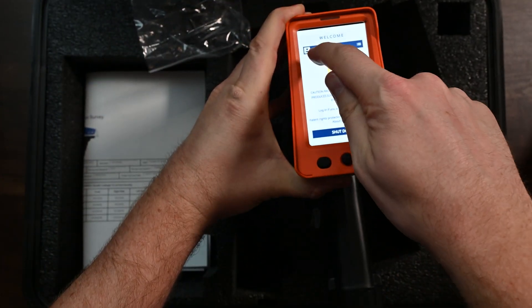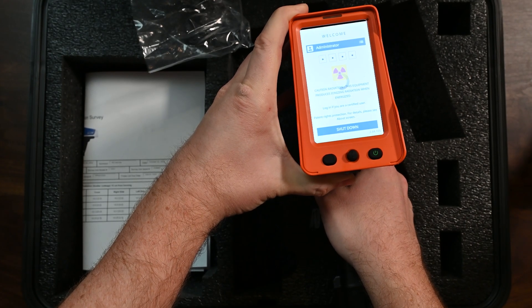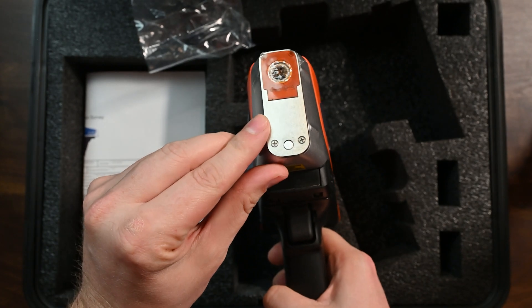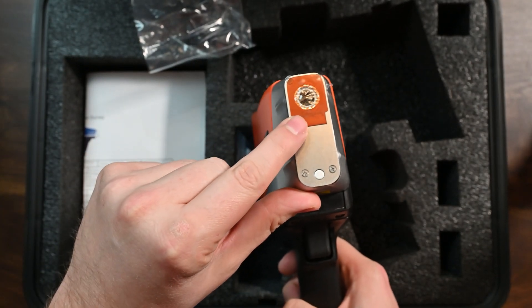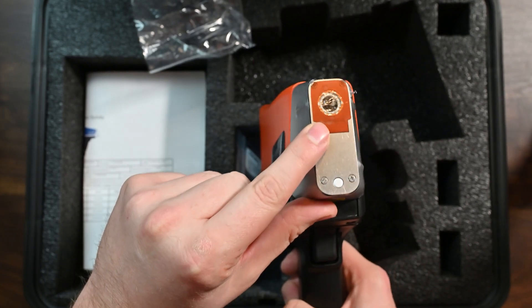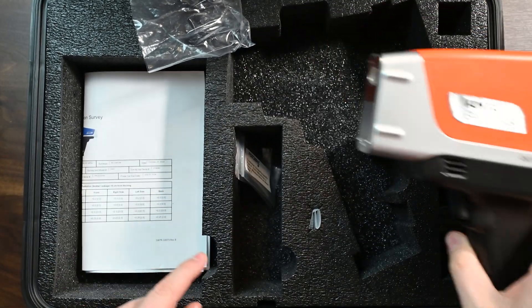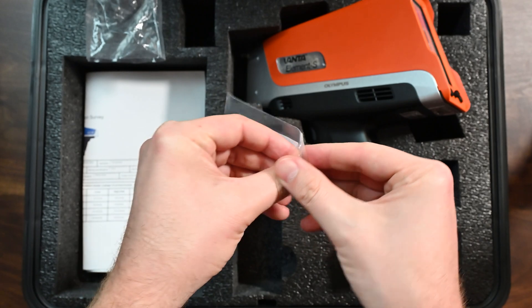Let's log into this instrument and let it boot up — I'll show you the startup process. While it's loading, let's look at the front of the nose. What you'll see here is there's a window that actually sticks to the front of the analyzer. I'm a big fan of analyzers with windows that stick to the front. This is actually a Kapton mesh window, and we have more windows here — you're given three replacement windows with your analyzer.